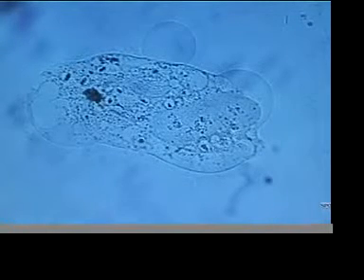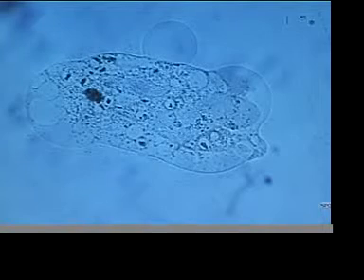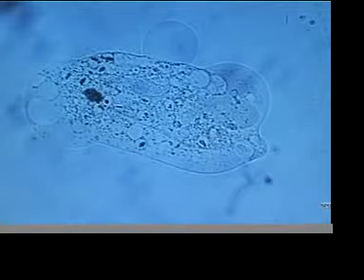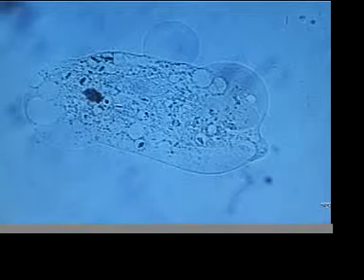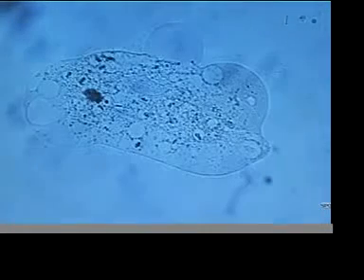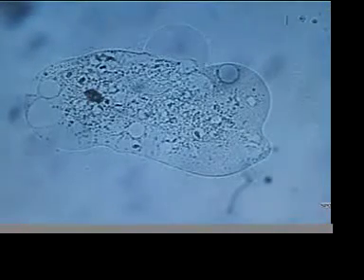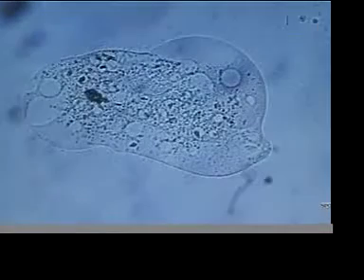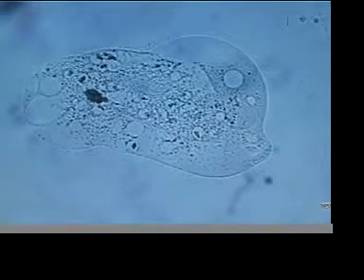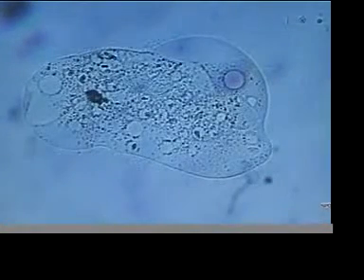We continue to see degradation in the organism. We're looking at this through a microscope filter known as a DIC filter, which gives us a nice sense of contrast and surface texture. You can alter the filter live. Now this is with the 40x objective, and I think you won't see quite as much variation. We continue to see changes in the organism. It's completely unrecognizable now. Formerly a paramecium.